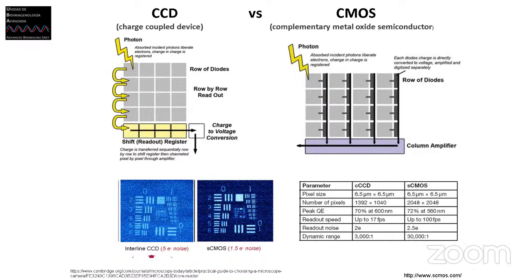And this is good because you have the same noise in the CCD pixel by pixel, but it takes a lot of time to collect an image because you have a very small entrance to your electronics, because you can do this only one by one.